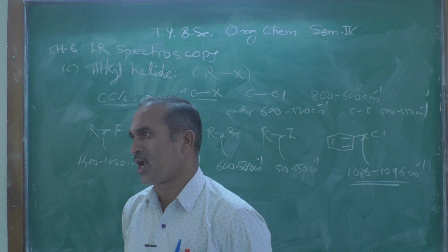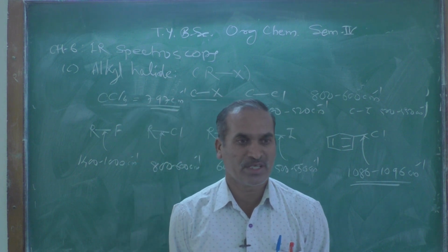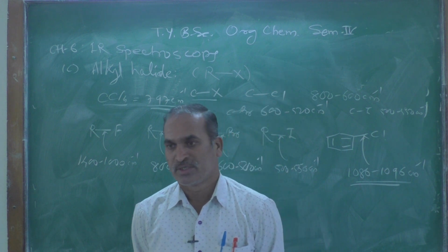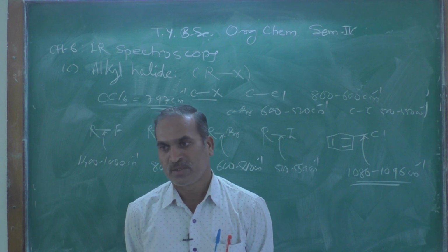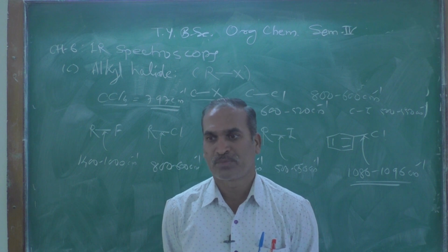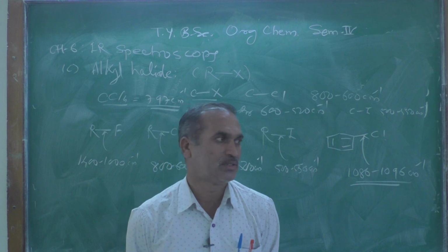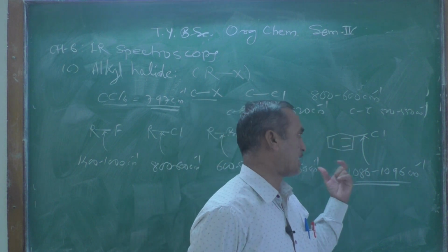This clearly shows that there is a chlorine atom attached to the aromatic moiety or the aromatic ring.